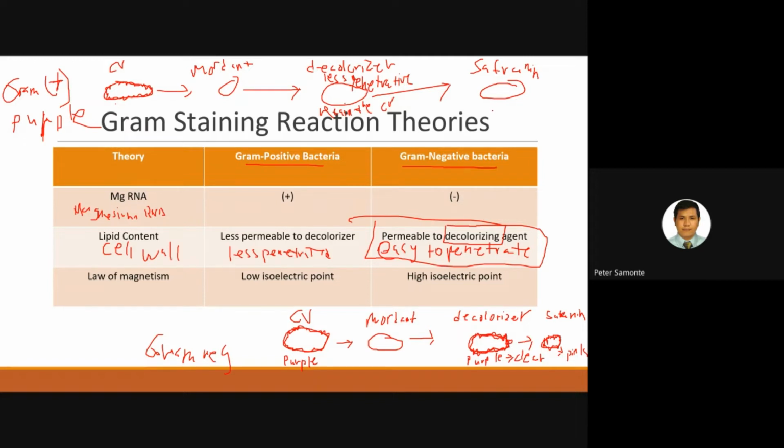Yes, Mel. Would it still remain, sir? It's because it can't penetrate, sir. Okay. So since you have your crystal violet retained in the cell wall, safranin is not able to enter the cell wall. Thus, it would have no effect. Hindi ma-absorb yung safranin.